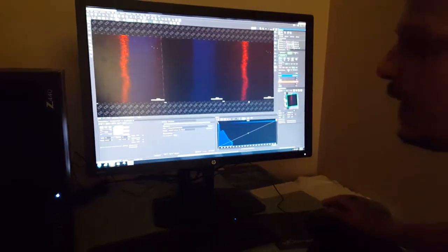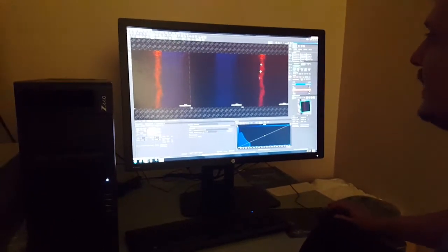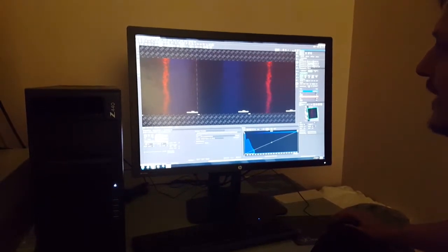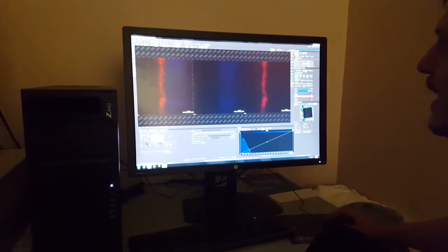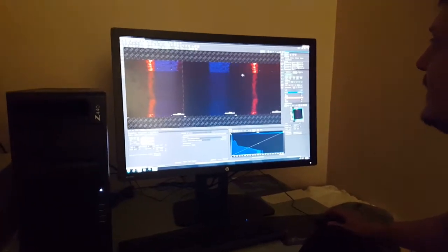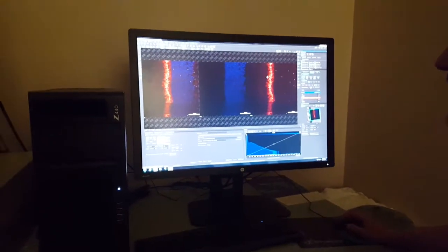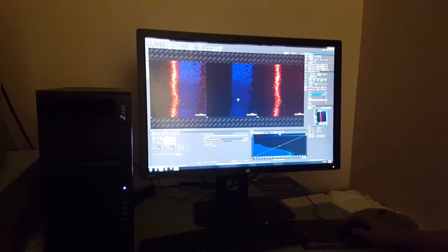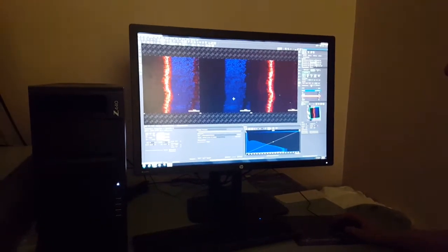So probably I want to see if I'm going farther top, if I'm not losing LPG1 here. It started to get dimmer, so I don't want to go farther up here. I'm going to set it as a new top, but then I want to go down and see if something is going on. And right there, I know that it's saturating. Probably I'm going to have more saturations. DAPI, as she said, is getting brighter, and now it's super saturating.